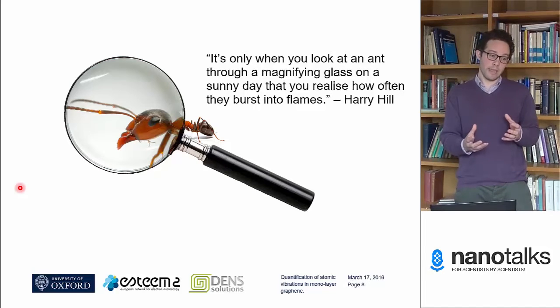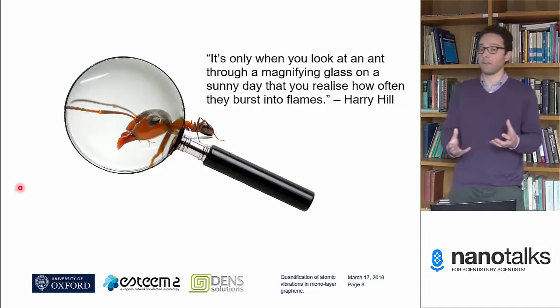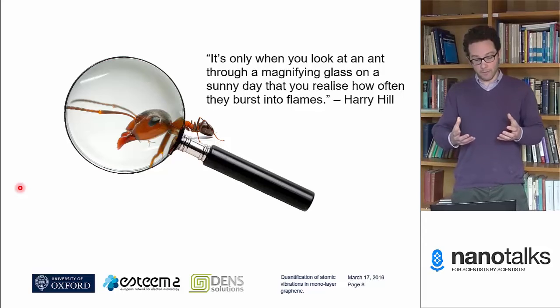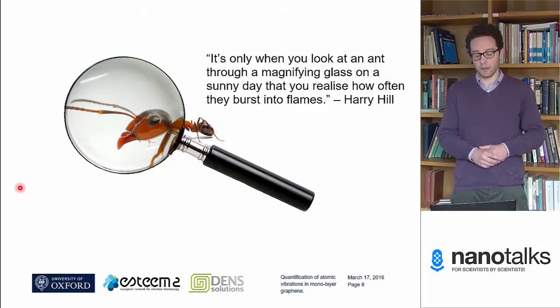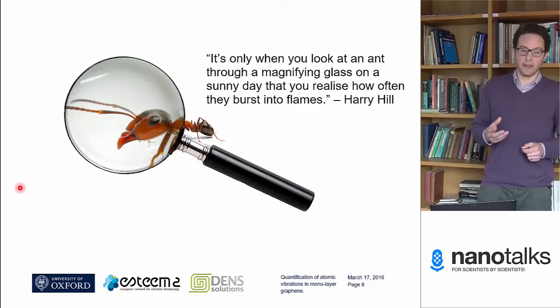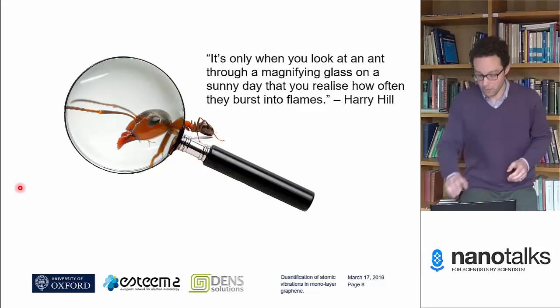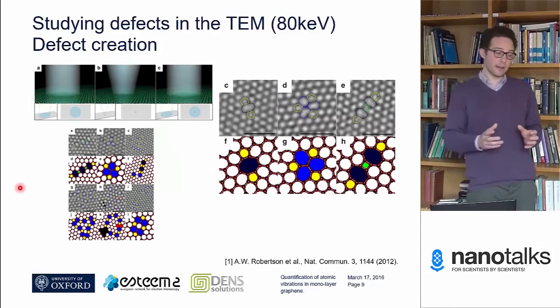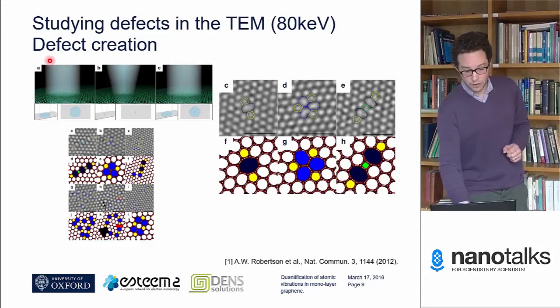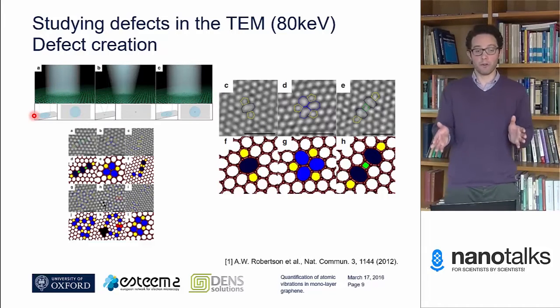By imaging our sample, we're bombarding it with large numbers of highly energetic electrons, and this is inevitably transferring energy to our system, and therefore we're not necessarily seeing the intrinsic behavior of our sample. In fact, in our case this is particularly true when we image our graphene at 80 keV inside the TEM. We would generally image with a broad, approximately parallel beam.